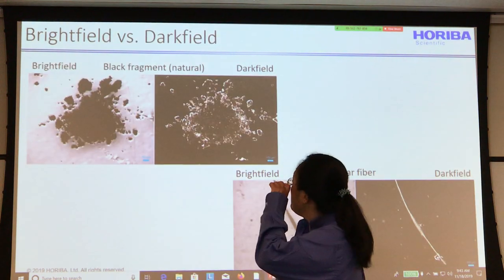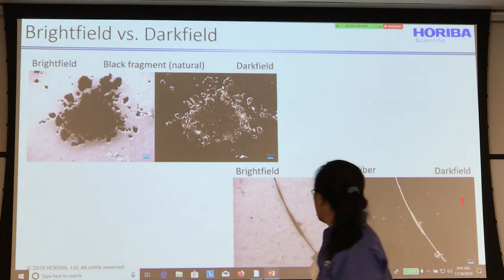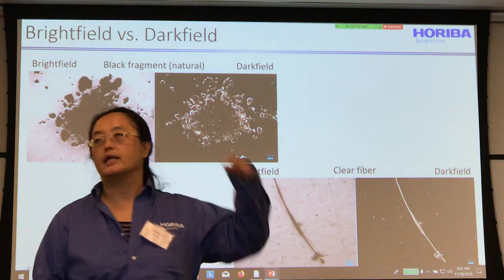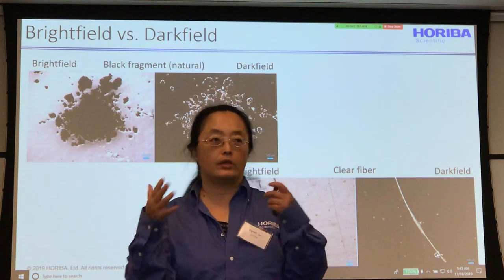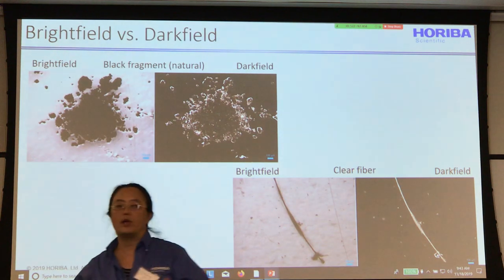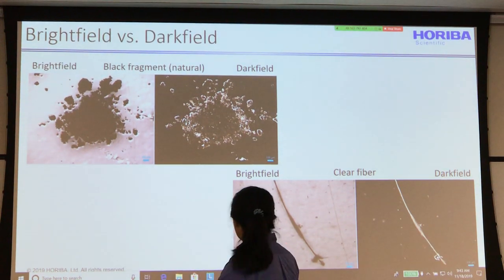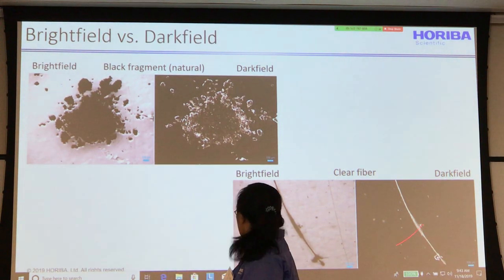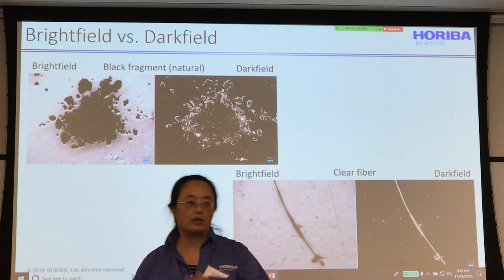Okay. And then bright field and dark field. These are actually the samples you guys worked on in October with Kina and Hannah, and that's how different it looks. I found bright field is very useful when I'm trying to find the target, because it comes out like this. But once I find the target and try to examine it, I find the dark field is a lot better. So we are gonna try a little bit back and forth.